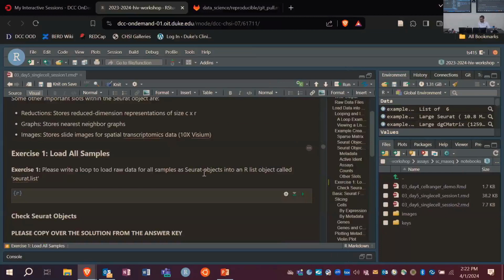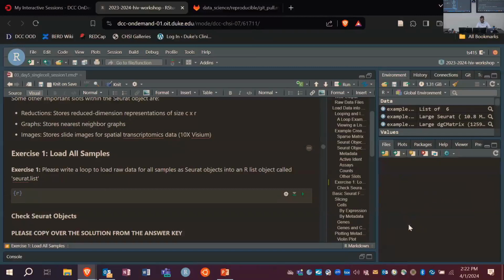Okay, so that was 3 minutes. Do you guys need any more time to try to work on it, or do you want to look at a solution? Okay, well, let's go ahead and take a look at one way of doing it.